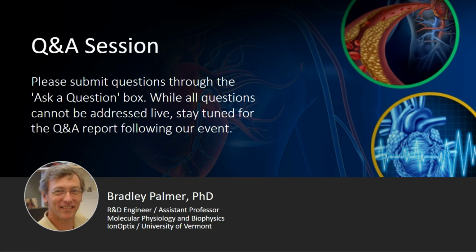But we still could generate the work loops. And like I said, it was just a matter of working with your disease state and understanding how it is actually affecting the myocardial function and still being able to work within that context. I don't know that I have more to offer with that.